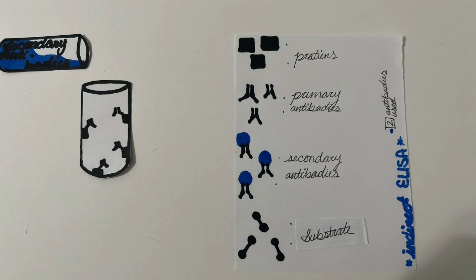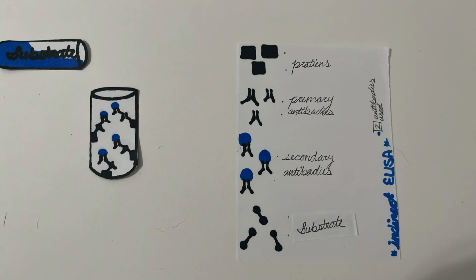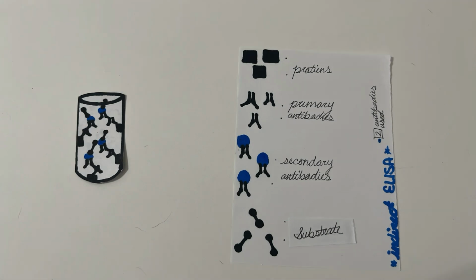Then a secondary antibody, which has an enzyme linked to the top of that, known as a colorimetric tag, will bind to the primary antibody. The remaining will be washed out, and then finally a substrate will be added to the wells, which will bind to the secondary antibodies, causing a color change. The color change is an indication that the antigen is present in the sample.